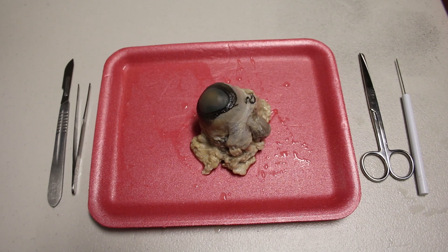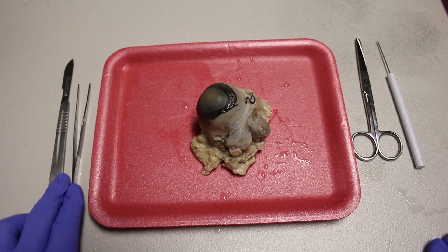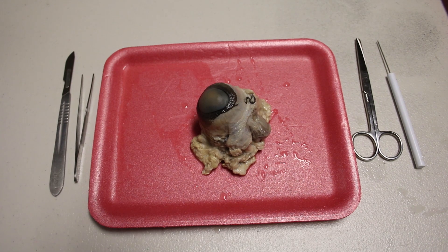Before we begin the dissection, you need to make sure you have all of the necessary equipment. You will need dissection scissors, a teasing needle, and forceps. You can also use a scalpel to make more precision cuts easier — just be sure to exercise caution. The safety equipment you will need includes gloves, a lab apron, and eye protection.